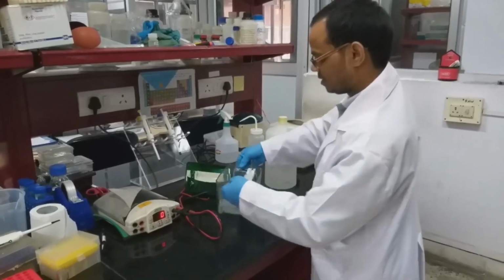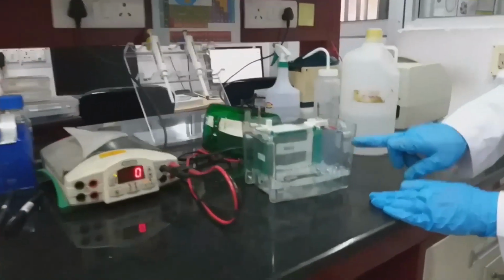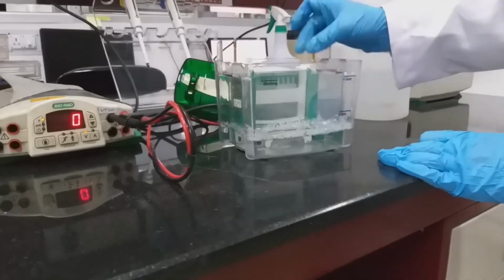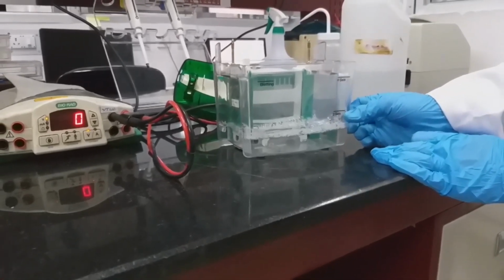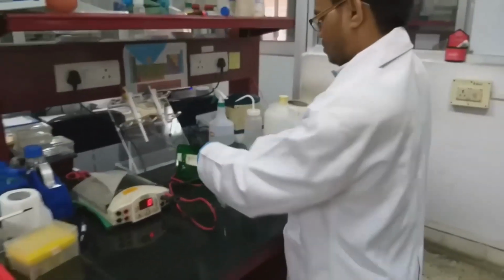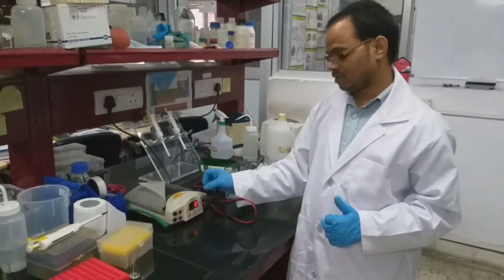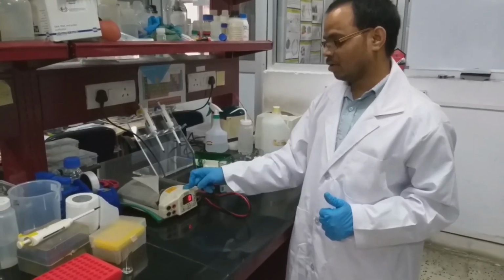So for reference, you can see here, for 4 gels we have to add the buffer till here. We have to load outside this gel. So for 2 gels here, for 1 gel we can add like this. This is the power pack where we can adjust how many volts we want to run.